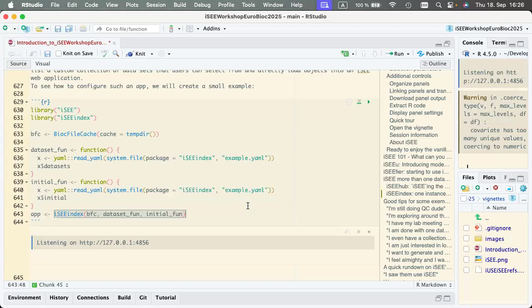You can control iSEE with your voice. Okay. I'm gonna demo that once we are offline because I don't want to record a fail. Because it's not Alexa, it's not Google Echo, so it's clunky, but it works. If you remember the meme of Jack Sparrow, it's the most ugly implementation of something that works with a voice, yet it works. So I can show it to you later.